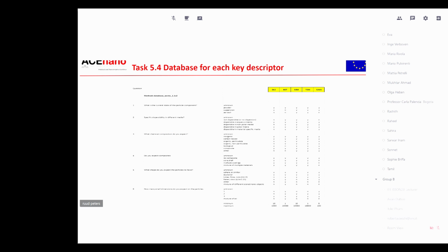Okay, this all has been going into an Excel sheet. This is just an impression here of the first version of the method decision tool, which was made in Excel. In total, it has two worksheets, one for the input and one for the matrix. And what you are looking at here is the worksheet containing the method performance characteristics of the method itself.